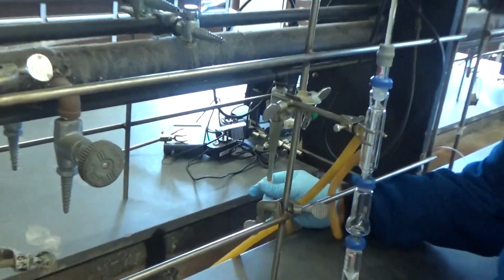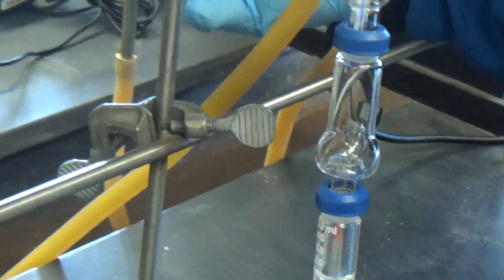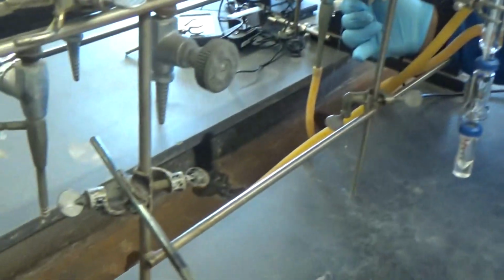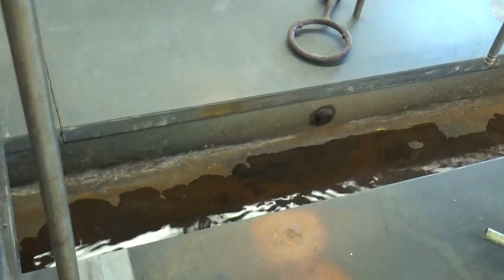Okay. So you're going to put the water onto the bottom hose, right? Yeah. Cool. Open that very gently, because it might shoot out. I don't want to baptize you. Don't baptize me. And we see water. Yeah, we see the gift of water in at the bottom.